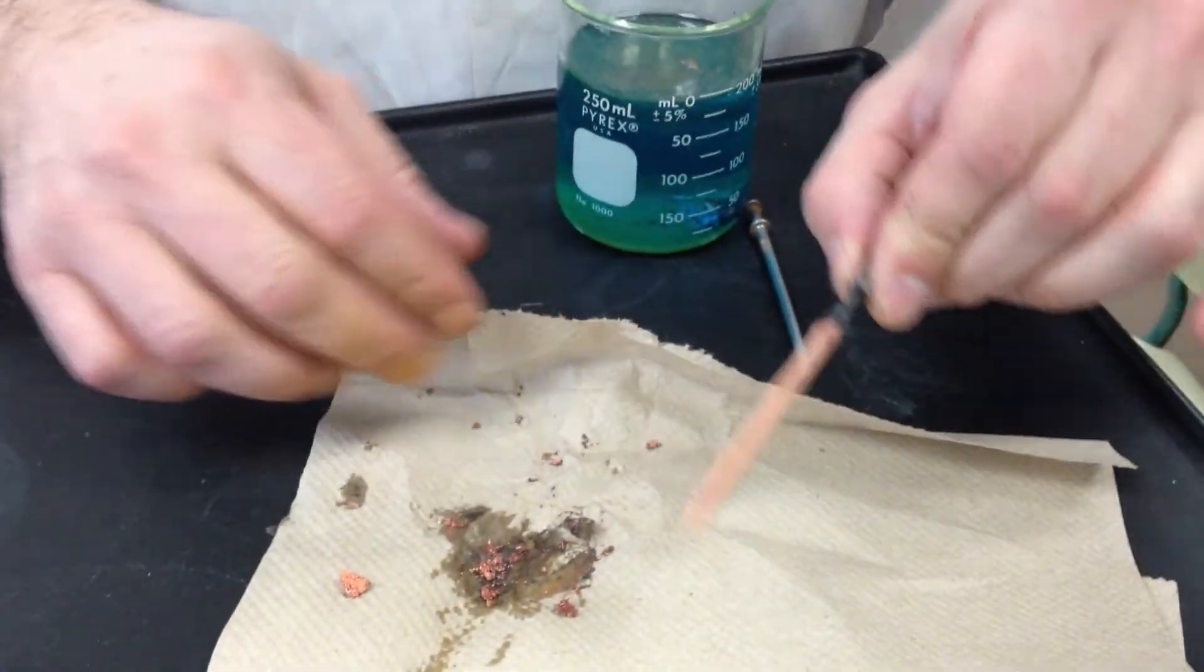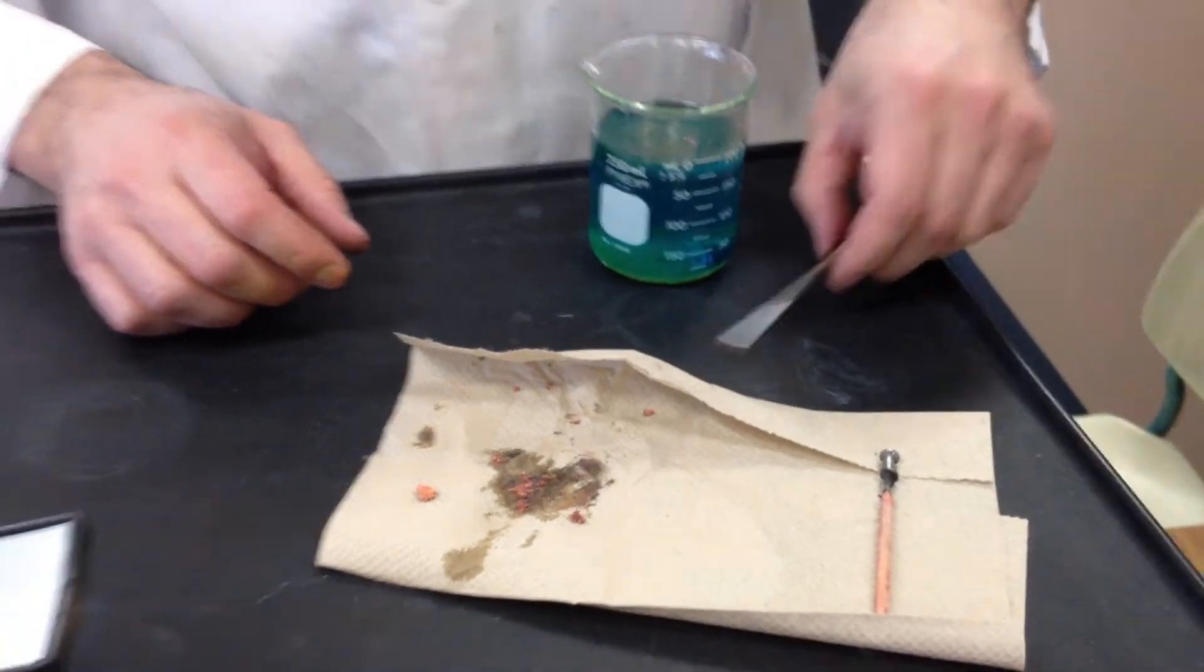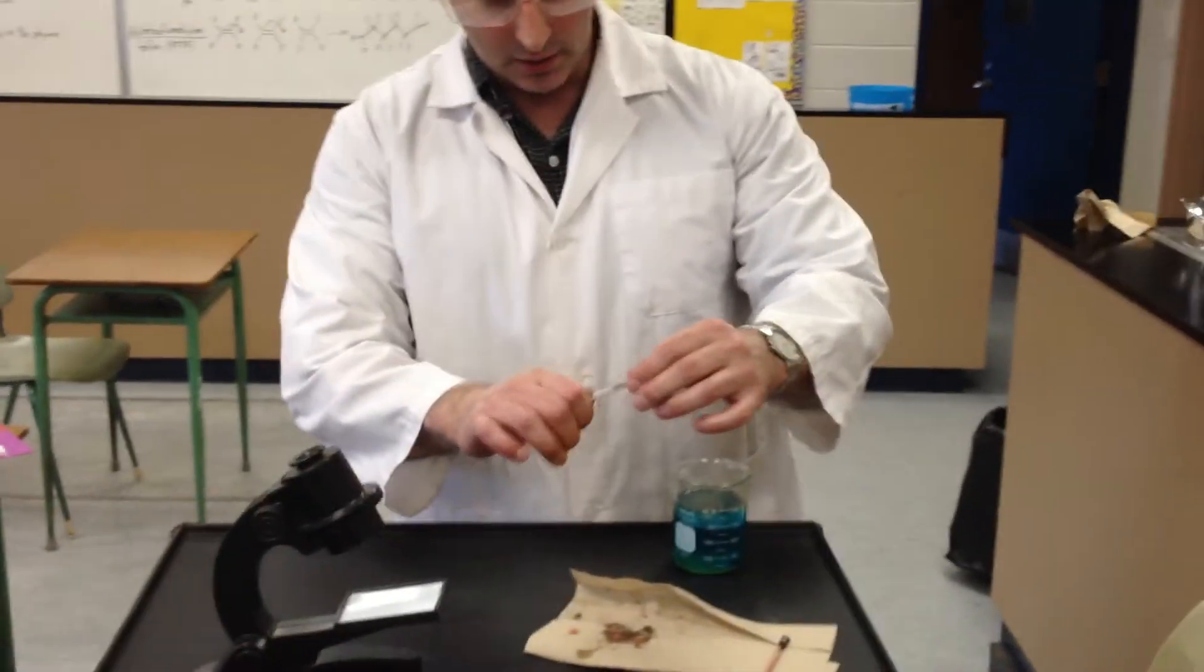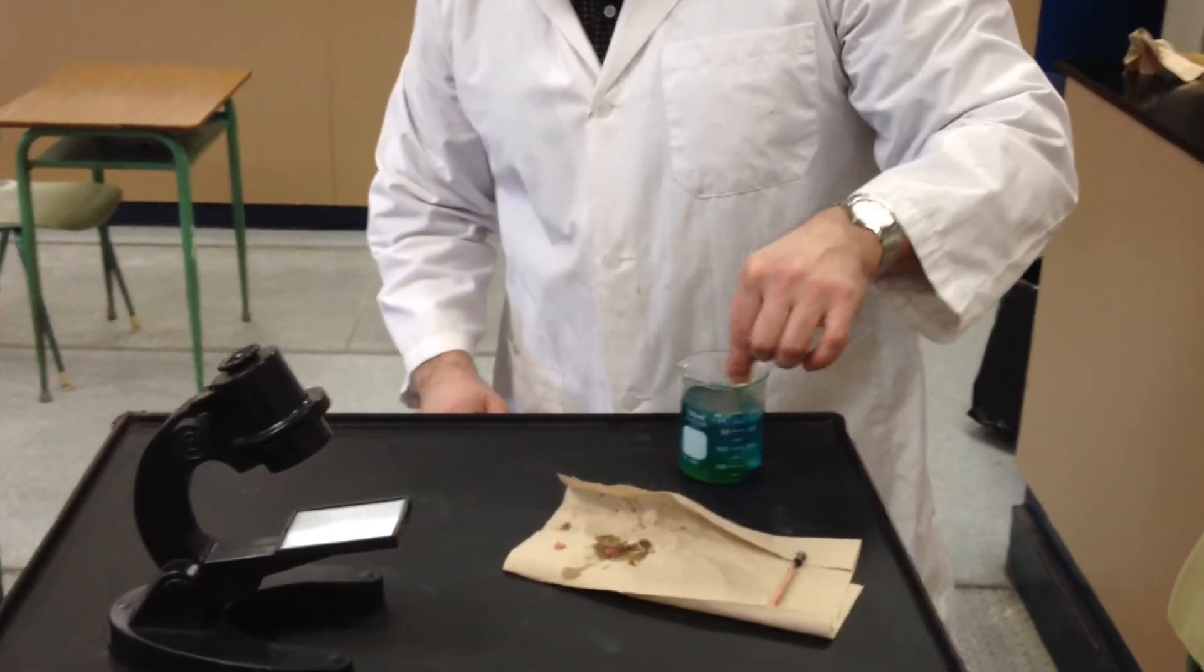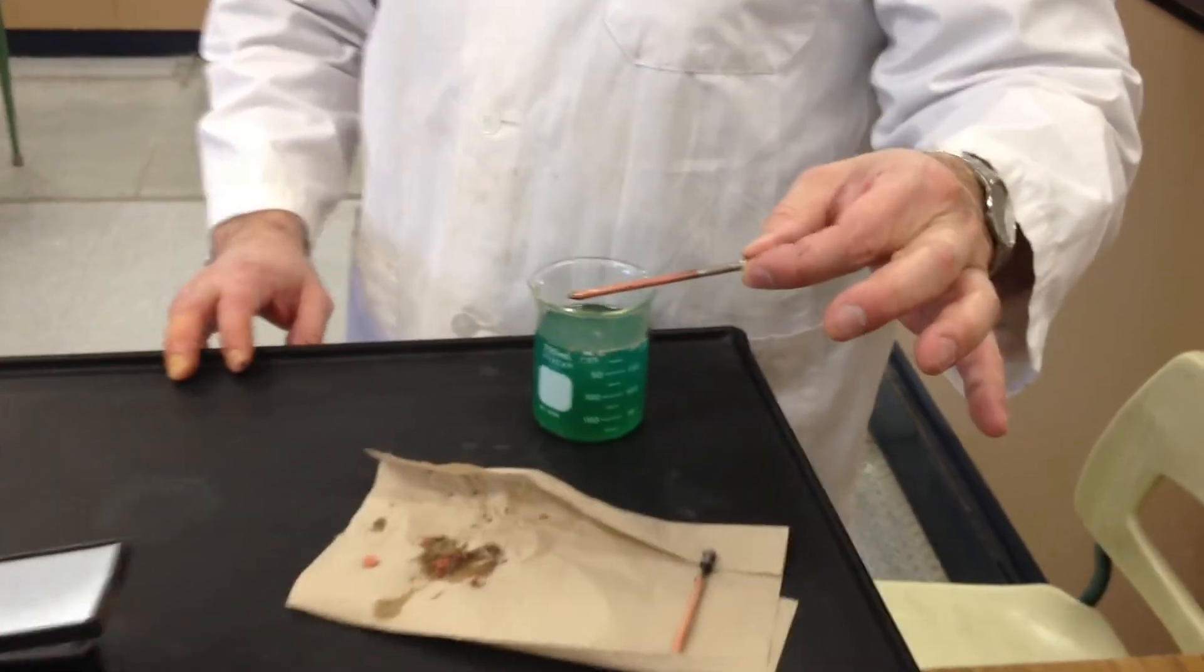So the copper was reduced onto the nail and the iron went into the solution. Now I've taken a freshly shiny nail to show you how quickly the reaction takes place. I'm going to stir the solution with the nail for only a few seconds, and you see already it causes the nail to become copper coated.